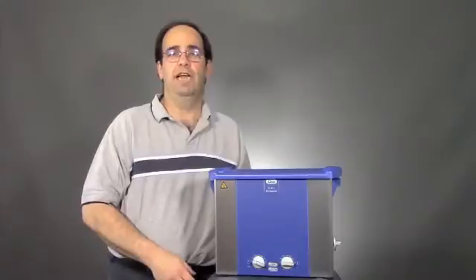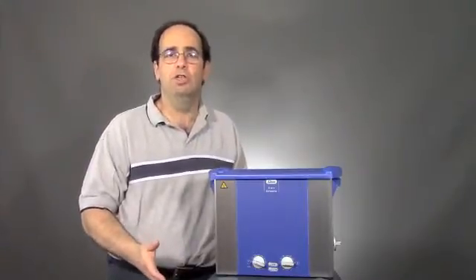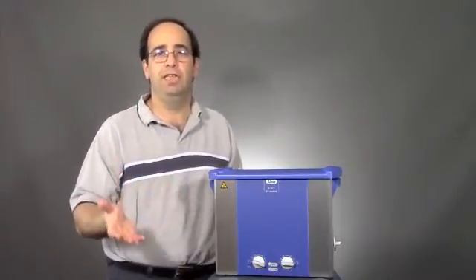Hi, I'm Bob Sandor with TovaTech. Today I want to talk to you about the different Elma Ultrasonic Benchtop Cleaner Lines.